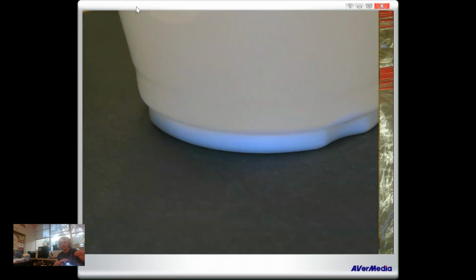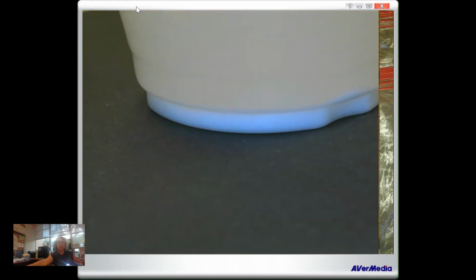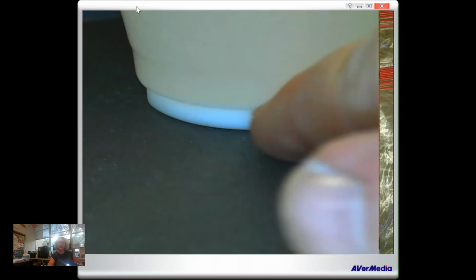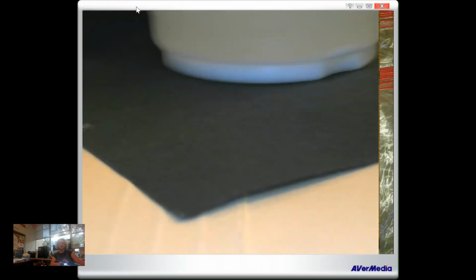All right, I don't know if you can see this very well, but down here at the bottom, that is sediment. If I put this behind it, will it help? A little bit. All right, so if you can see that this line right here is a little bit wider, that's because it's thick with sediment. It's just laying there as a layer on the bottom.